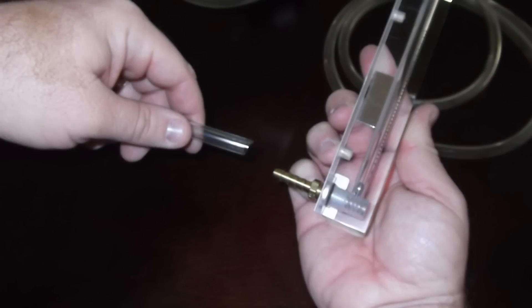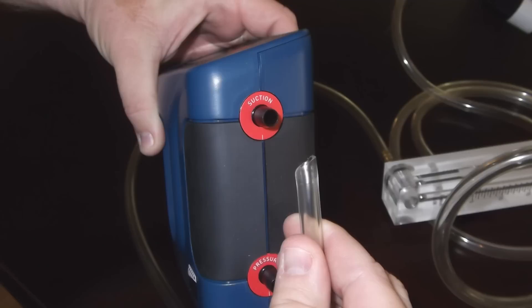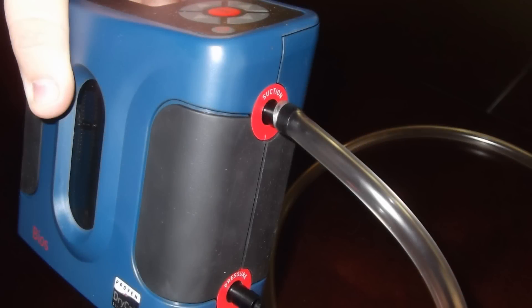Then connect the suction side of the rotometer, which is also the bottom, to tubing, which is then connected to the suction side of the primary calibrator. We are utilizing a BIOS Defender 510 dry calibrator.